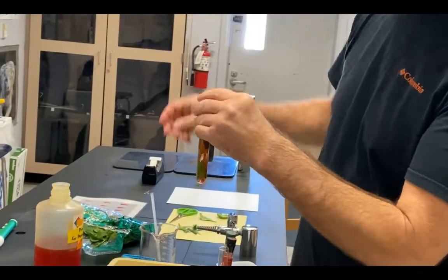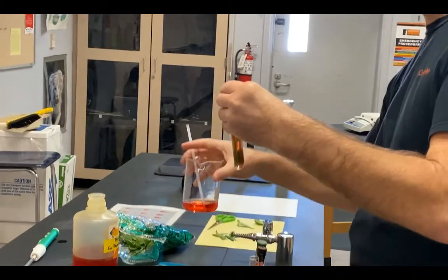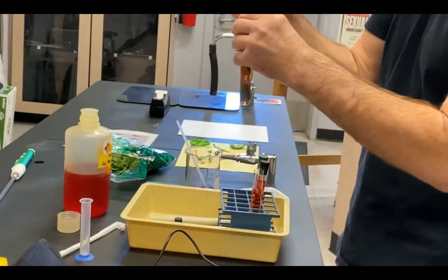And I want to make sure that all of it is immersed in fluid. So I can top off tube number 1. Put a cork in that one.